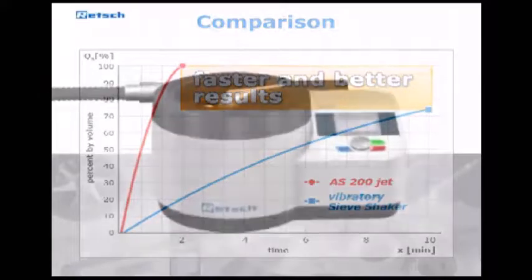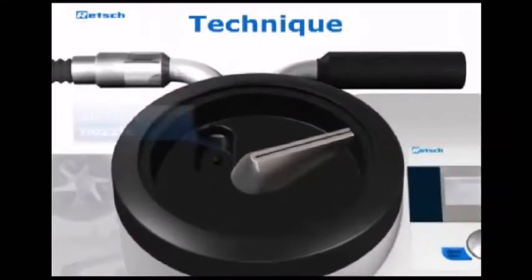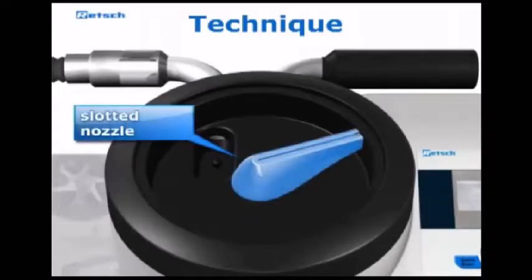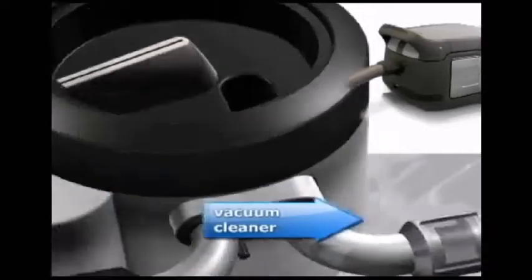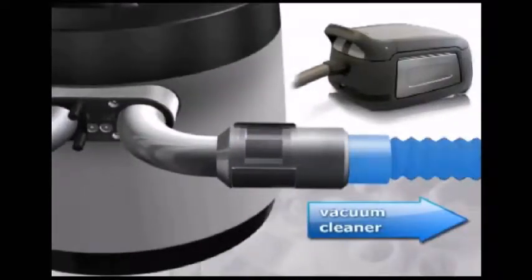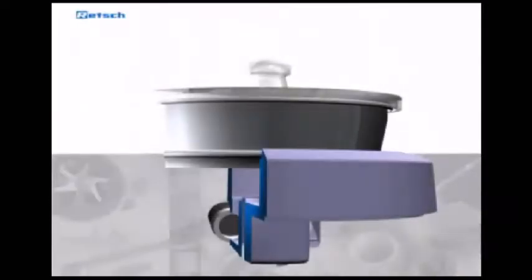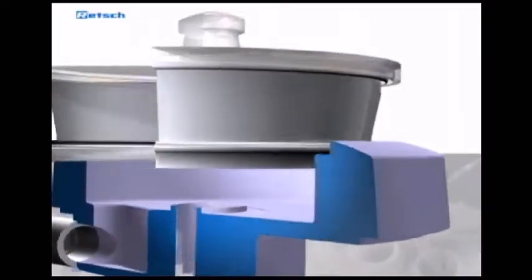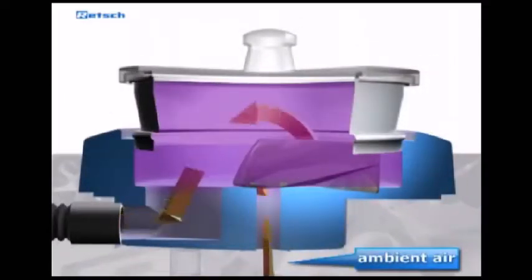The reason for the effectiveness of air-jet sieving is based on two components: a rotating slotted nozzle which is connected to the ambient air, and a high-performance industrial vacuum cleaner which is connected to the compartment. When the vacuum cleaner is turned on, it generates a vacuum inside the sieving machine. The resulting suction pulls ambient air through the slotted nozzle.